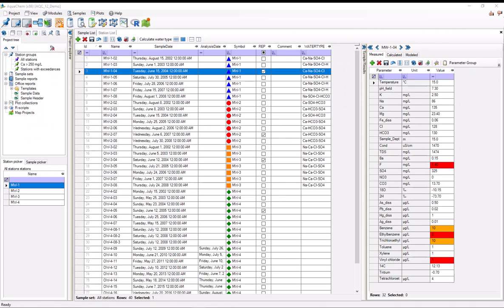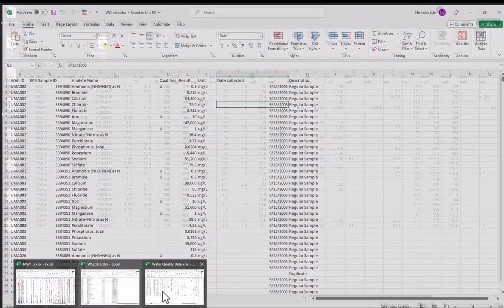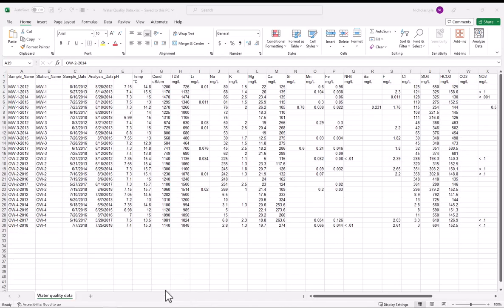And now I can start importing data. But actually, before I start importing data, I should probably take a look at the data first. So this example that I just showed you had samples as rows.